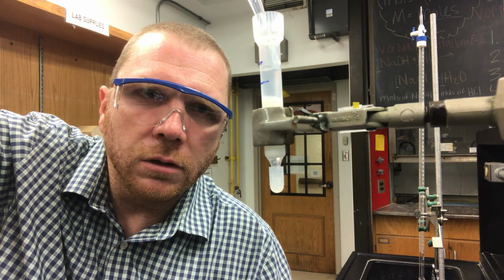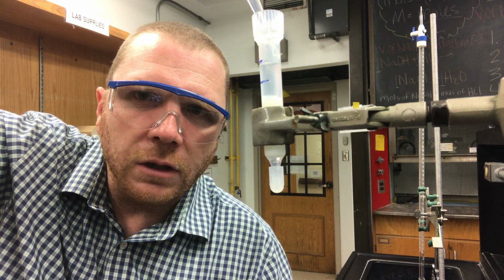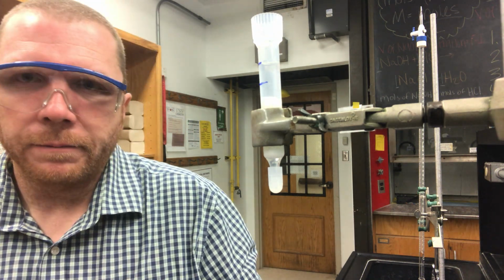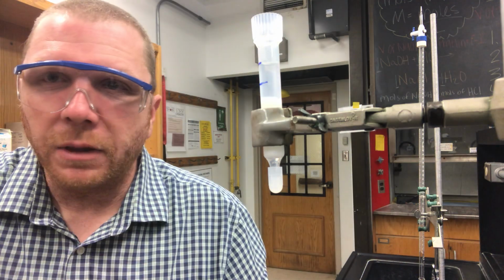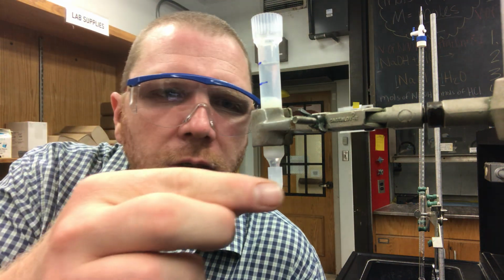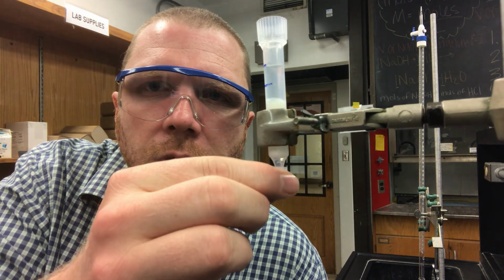my solution. And I'm adding it so slowly so that the resin bed does not get kicked up. Likewise, I'm adding it to that top line, okay? So now my solution has not exceeded the top line and it has not gone below the lower line. What I'm going to do now is pull this cap off to demonstrate how quickly this flows.